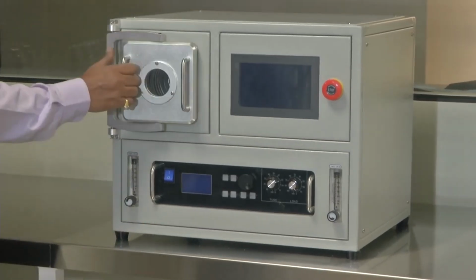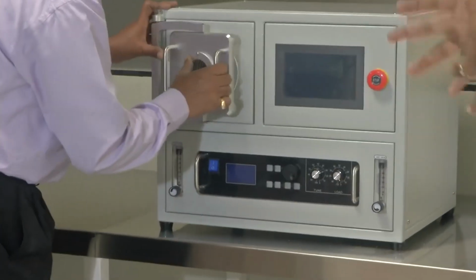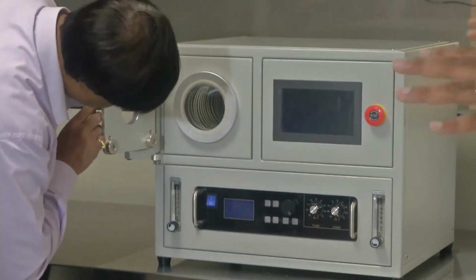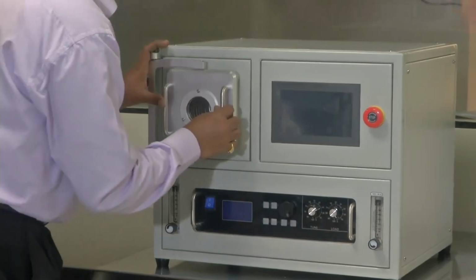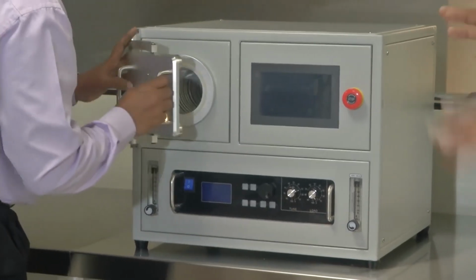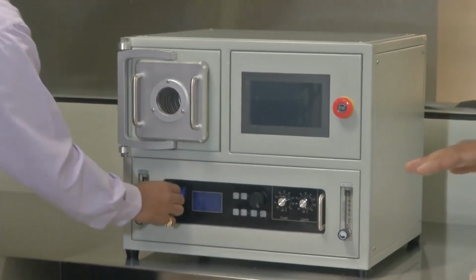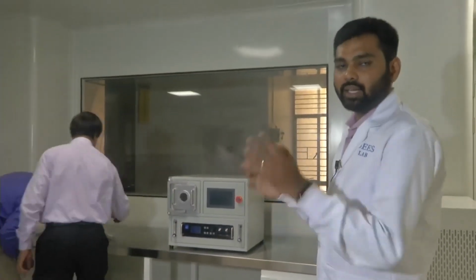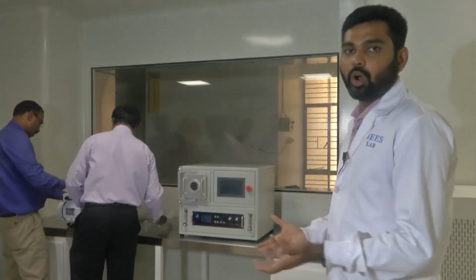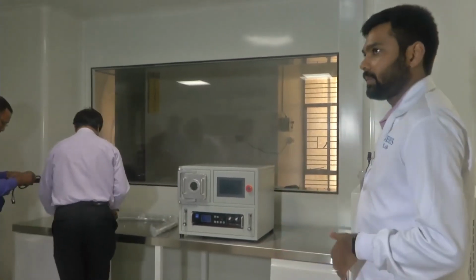Now as you observe, they have not gowned, they are not wearing suits, because right now we have suspended the activity of the clean room because we are installing an equipment. So that is the protocol. When you are installing equipment, you suspend all functional activity in the clean room. Then you install it, check everything, and then restart all the cleaning process, and you again follow the protocol of gowning and coming in.